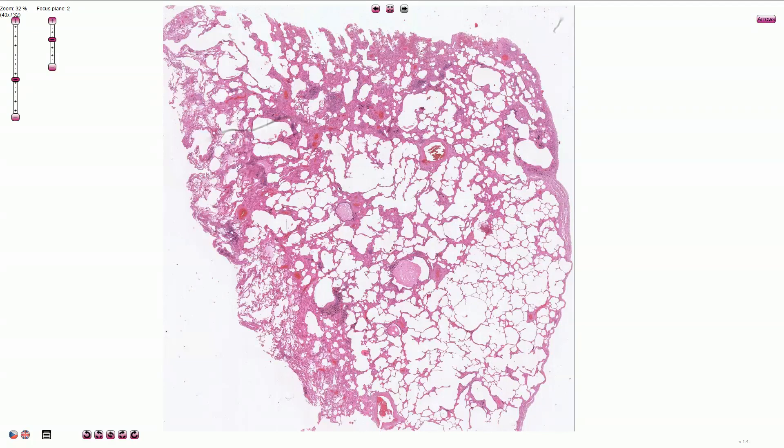Pulmonary emphysema is defined as permanent abnormal enlargement of air spaces distal to the terminal bronchioles, with destruction of the alveolar septi and little or no fibrosis.